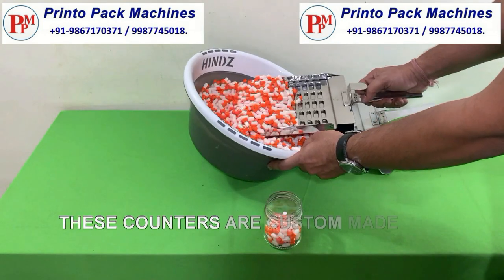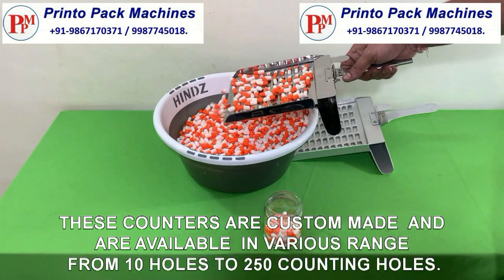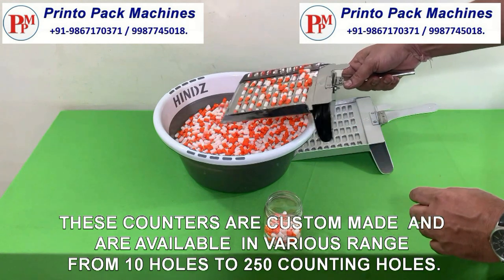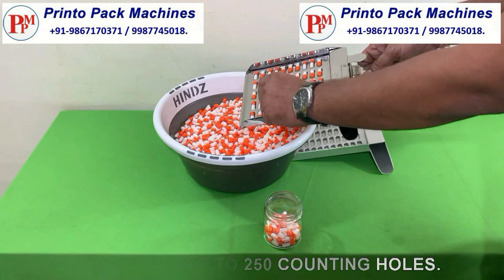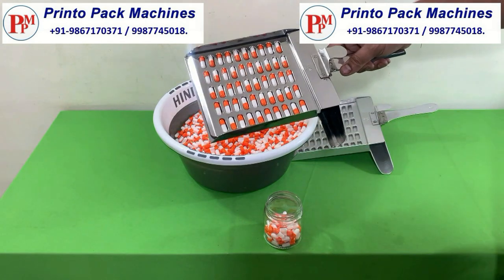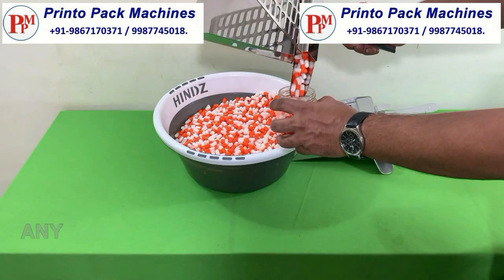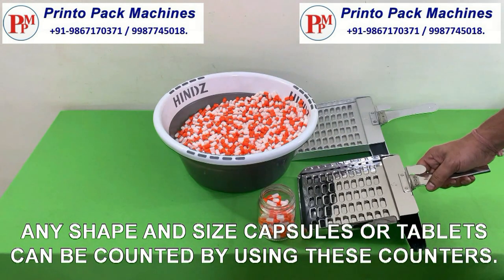These counters are custom made and are available in various ranges from 10 holes to 250 counting holes. Any shape and size capsules or tablets can be counted by using these counters.